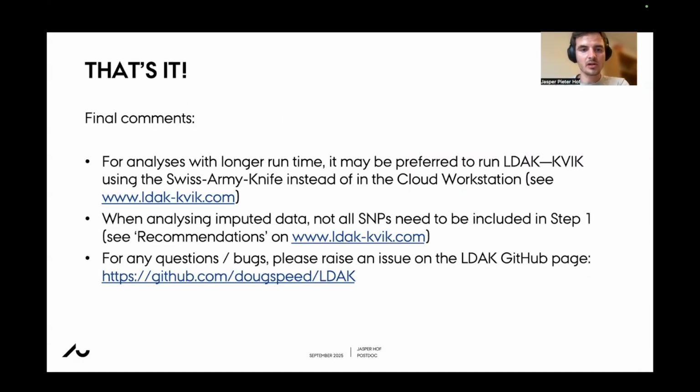So as I mentioned earlier about imputed data, for analyses that do have a longer runtime, it may be preferable to run LDAK-KVIK using the Swiss Army knife instead of the cloud workstation, because we find that when this does take a couple of hours, this is just a bit more practical. Particularly when analyzing imputed data, it's good to work with the Swiss Army knife.